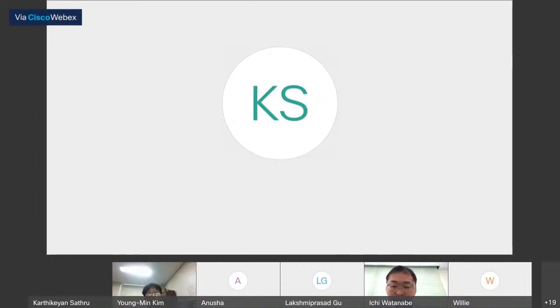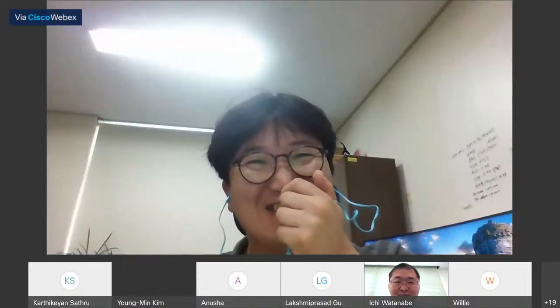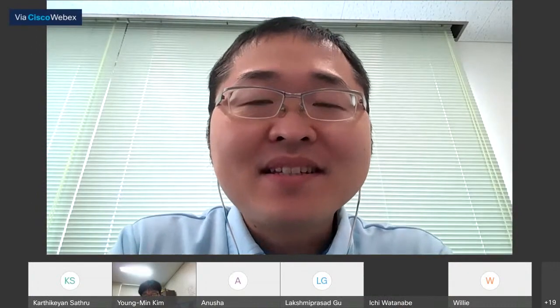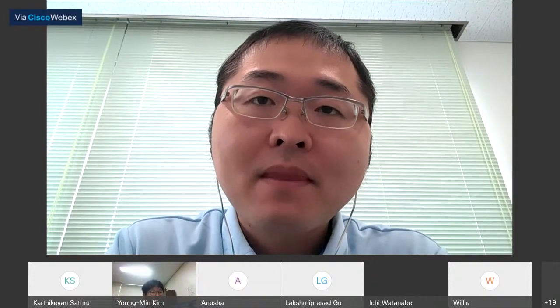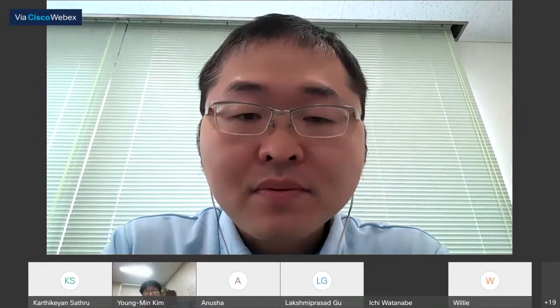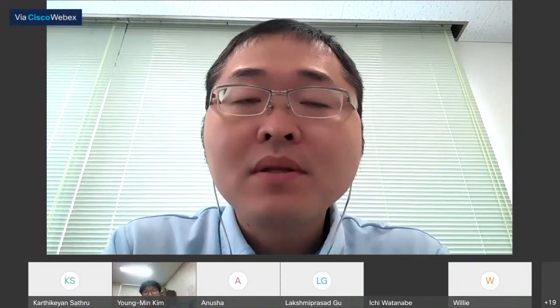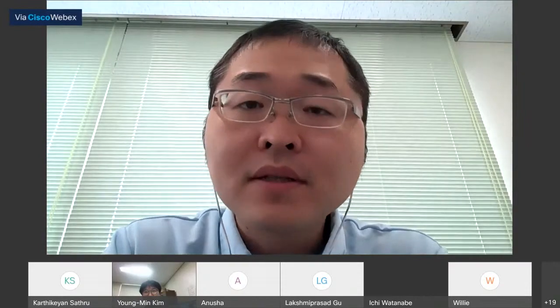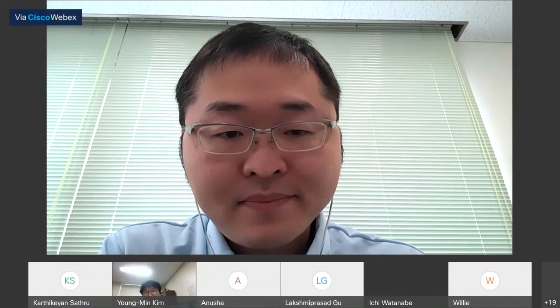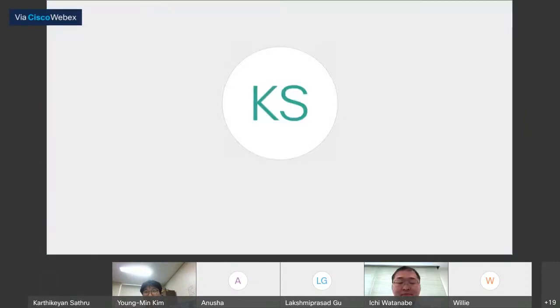I think so. Yep. So for microplastics analysis, the pyrolyzer is the best choice, because the tandem microreactor is for catalytic conversion or catalytic reaction. So depending on the purpose of the analysis, you choose which instrument you are going to use. Yes, okay. Thank you.